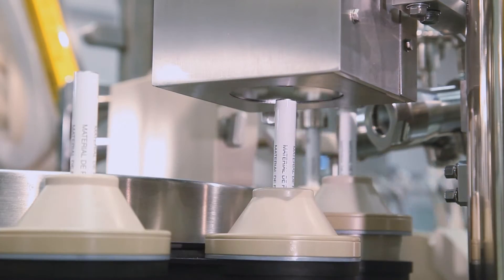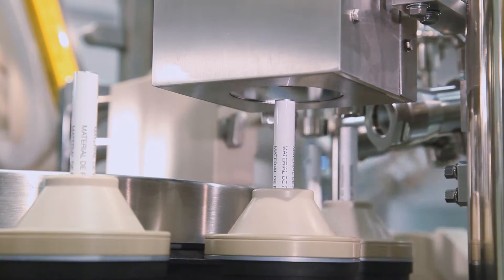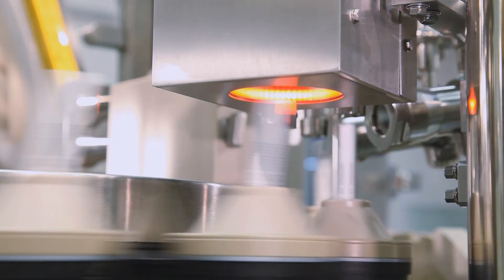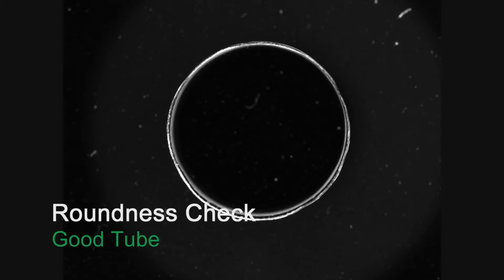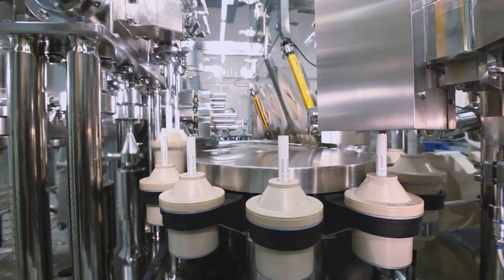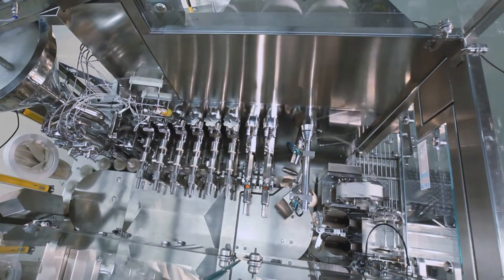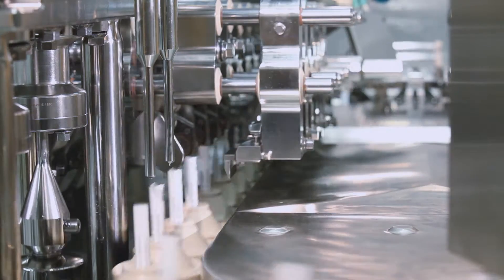In the next station, the tubes are checked for roundness via a camera system which is also integrated in a cGMP compliant housing. Tubes which are out of round are not filled and are ejected later in the process. The whole tube transport system is designed so that no cleaning agent can flow into the drive segment. All columns on the table are sealed to avoid cleaning agents reaching into the machine. The machine guarding is constructed for optimal laminar flow within the machine to avoid foreign particles entering into the open tubes.